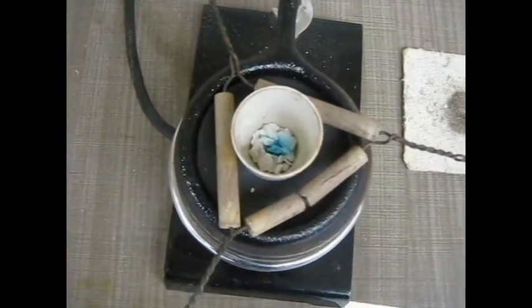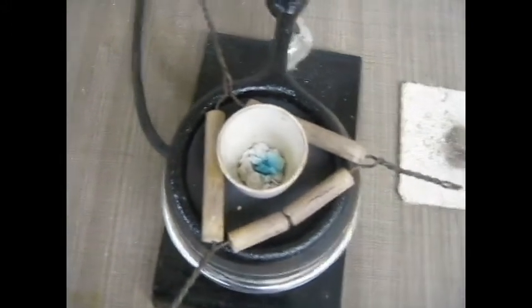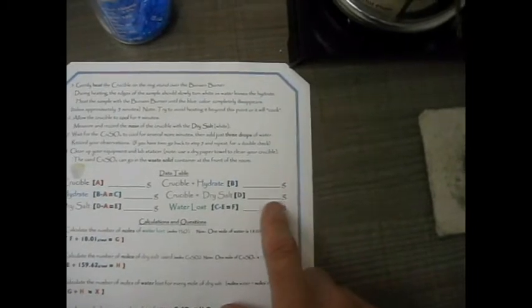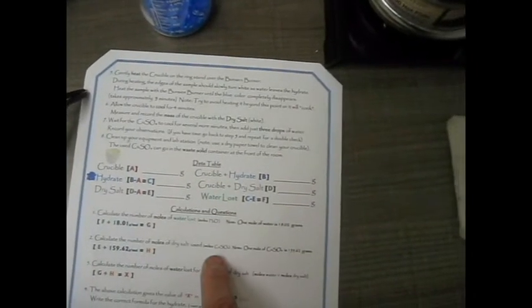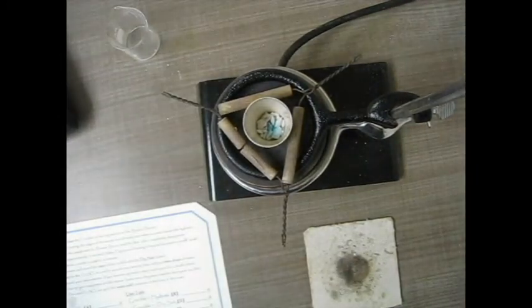Okay, if I get rid of that, again, that little bit of water I added shouldn't take too long, then that will double check my initial number for the crucible and the dry salt. I can write it on the side here, and then these two numbers should be about the same, really, and whichever one is lower actually has less water. That would be a better one to use for all my calculations. Okay, so this is a double check, and I'm going to put the camera here to watch that fade. This should be very quick, and then we're going to take the mass one more time, and that's it for the experiment. Okay.